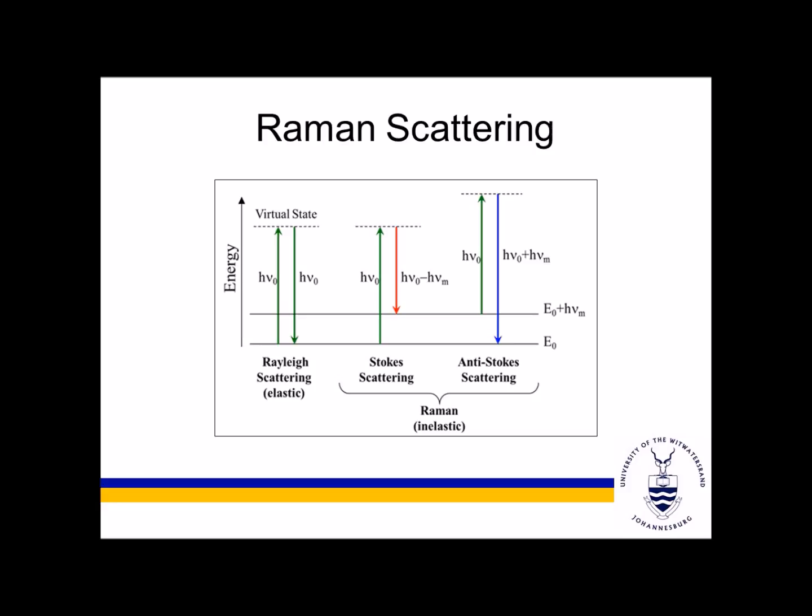In Raman spectroscopy, we use high-intensity radiation in the visible and infrared wavelengths and pass it through a sample. These photons then excite the sample to a virtual state and harmonically polarize the sample. This polarization can couple with other excitation states within the molecule, most likely vibrational, rotational, or electronic states. If a molecule's polarization does not couple with any of these other excitation states, we tend to see Rayleigh scattering. This means that the incoming photon has the same energy as the scattered photon. But if this polarization does couple with one of these vibrational modes, we tend to find that there is Stokes scattering.